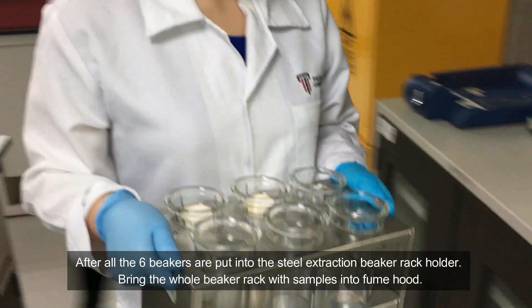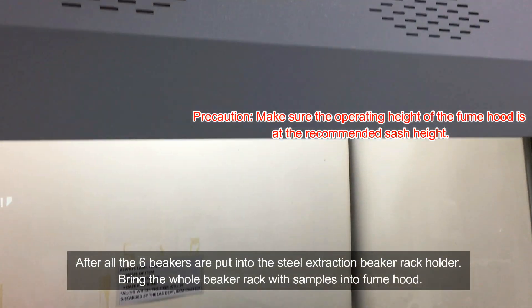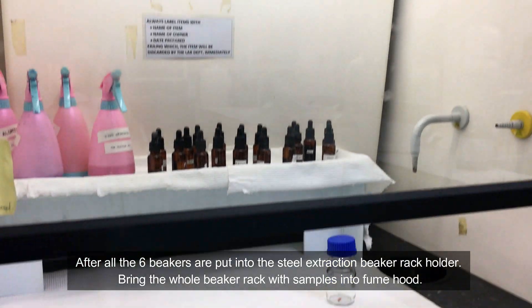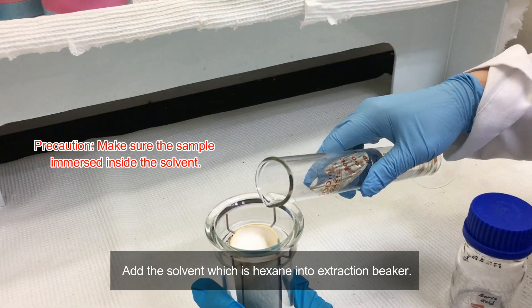After all 6 beakers are put into the steel extraction beaker wrap holder, bring the whole beaker wrap with sample to the fume hood. Add the solvent, which is hexane, into the extraction beaker.